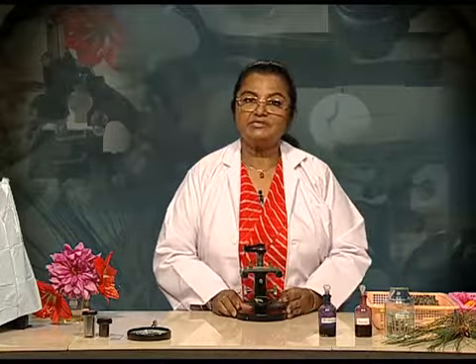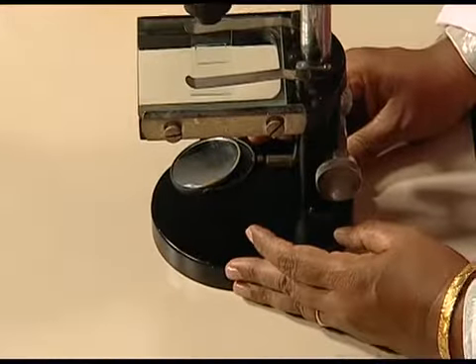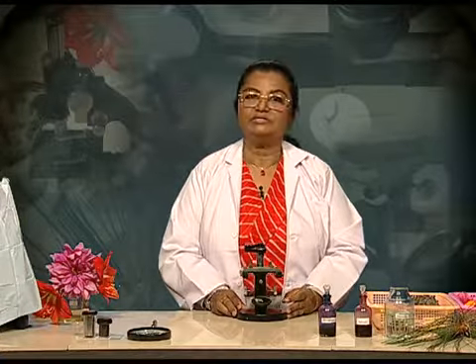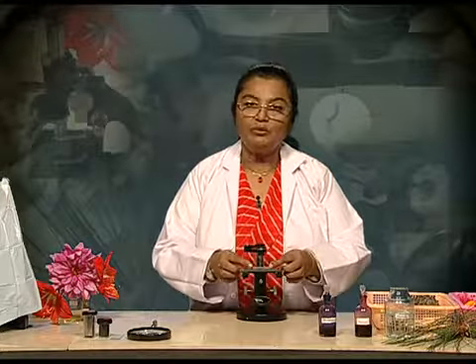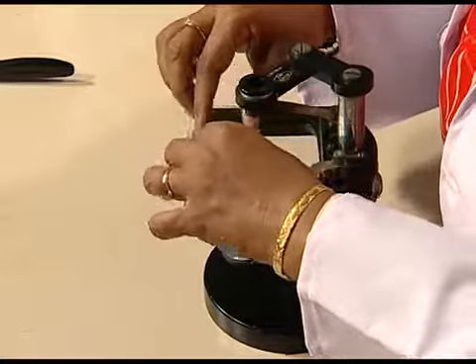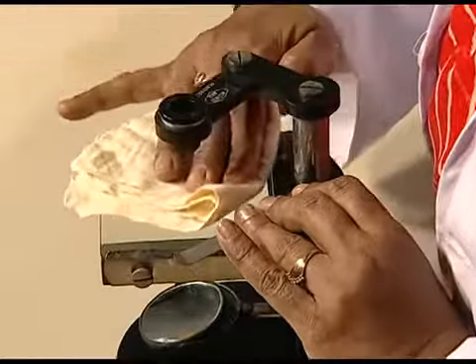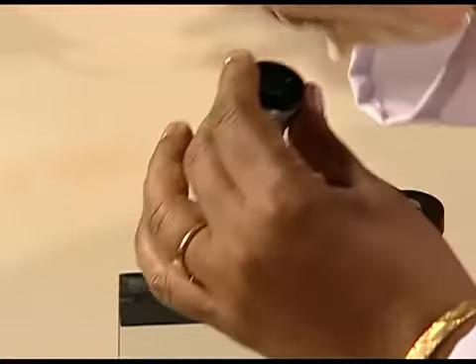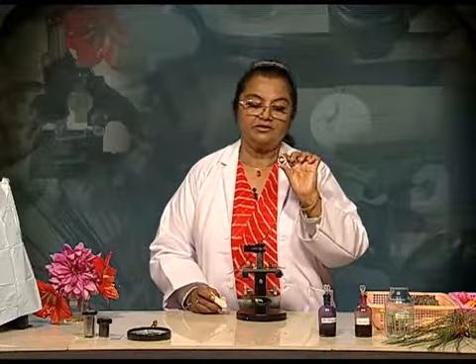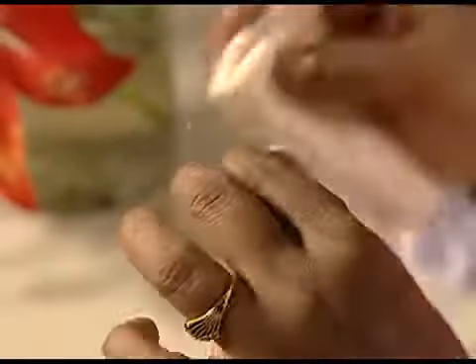Because these microscopes are expensive, we should also be taking care of them. Let us see what care is required for the dissection microscope. After you finish with your experiment or observation, remove the slide. Once again, wipe clean the stage and lens. Just take care that there is no remnant of any glycerine, stain or water on the lens.